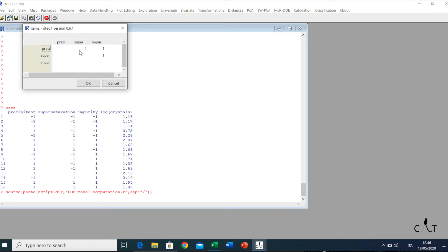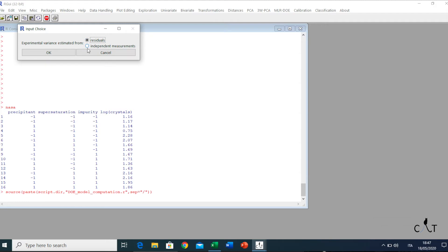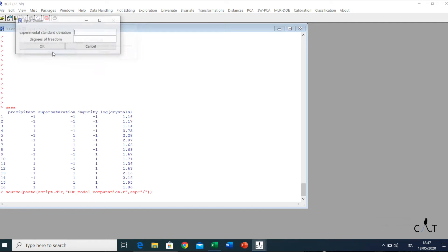This dialog box defines the higher terms of the model. In this case, we have the cross terms. If not all cross terms are required, we have to input 0 in the corresponding cell. But in this case, we want to consider all of them and their interactions, so we put 1. We click OK. A new dialog box appears, which allows us to estimate the experimental variance using the residuals or by independent measurements. We click on that, and the experimental standard deviation was 0.125 with 9 degrees of freedom.